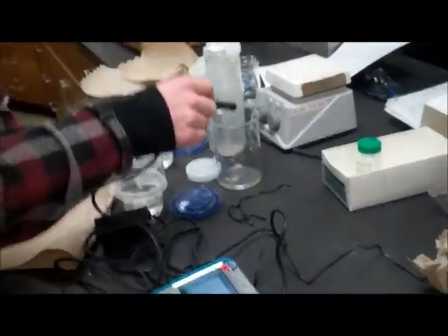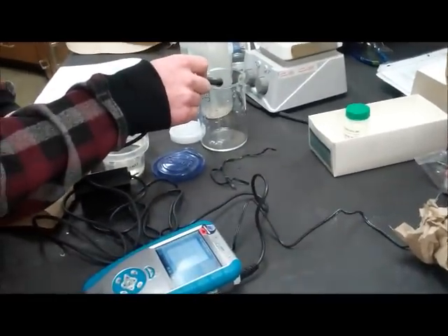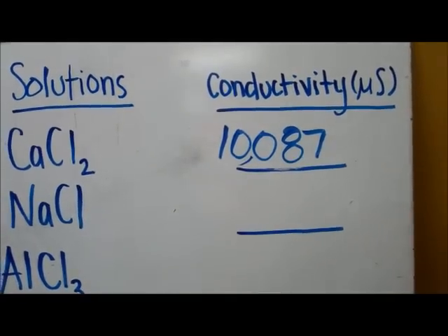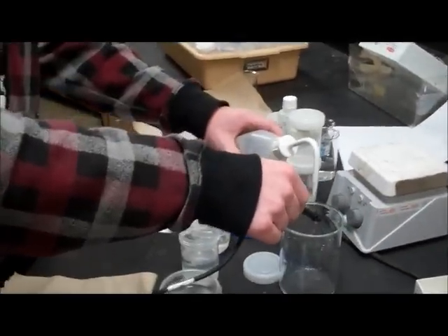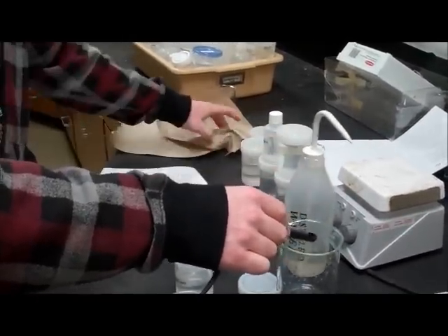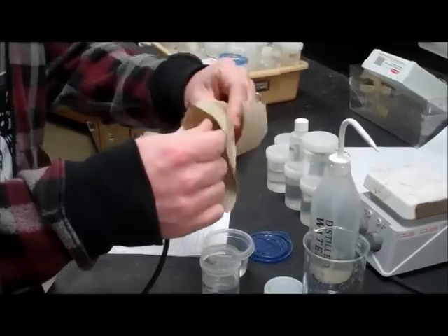Okay, the reading is 10,087. Now Race is rinsing the conductivity probe and drying it.